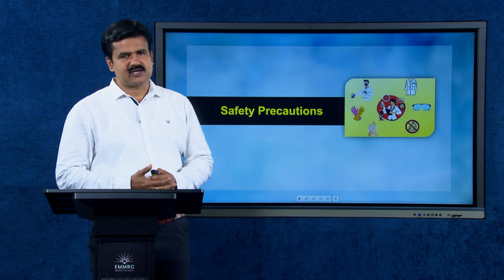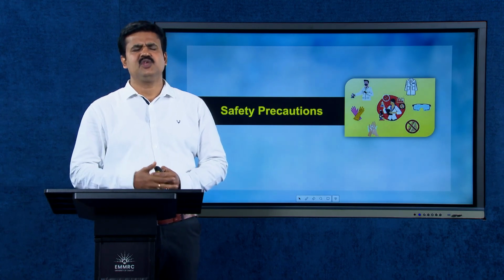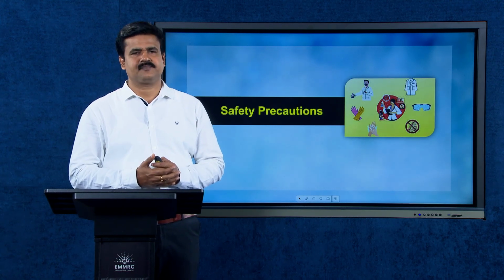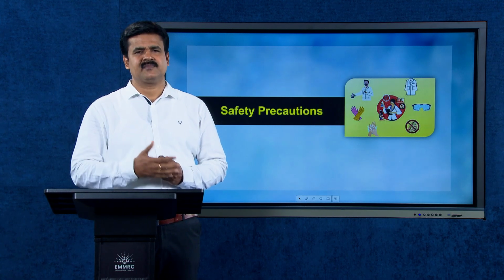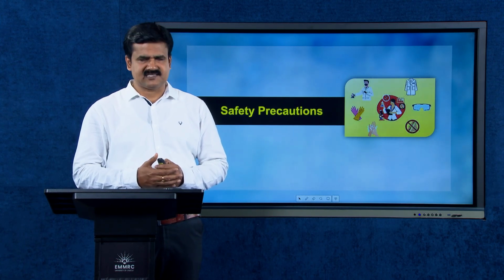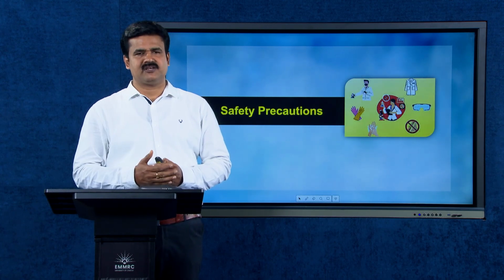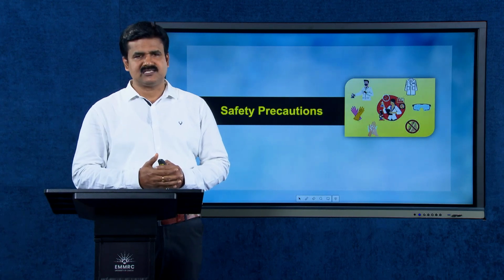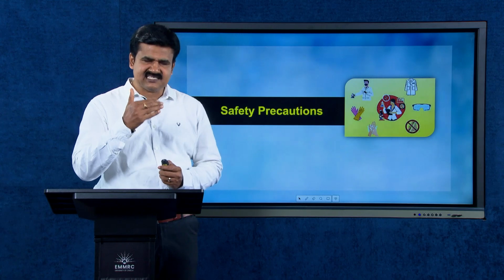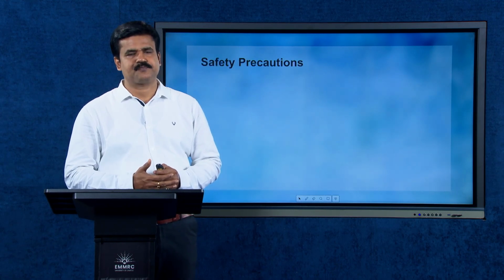It should be noted that in a chemistry laboratory, you have to handle different kinds of chemical reagents. Most of them are toxic and may cause deteriorating or hazardous effects. So, safety precaution is of paramount importance as far as a chemistry laboratory is concerned. In this section of this module, we are focusing on such safety precautions.